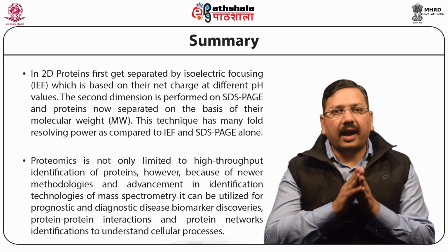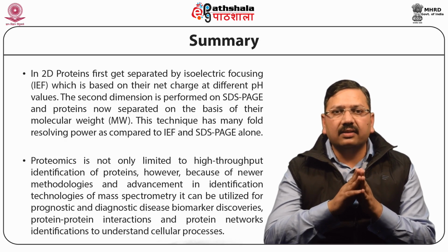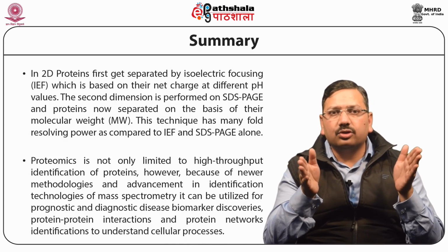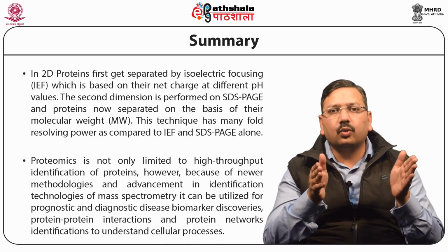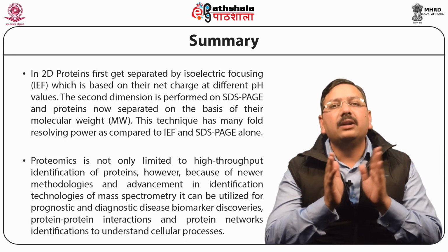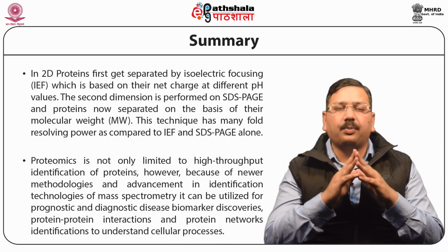After that, the ion currents corresponding to the different species are amplified, and these are either displayed on an oscilloscope or a chart recorder, or they are stored in a computer, and this section is required as a detector. Now coming to the application part.